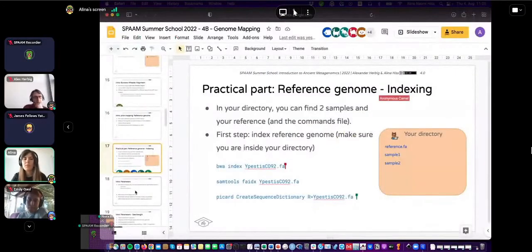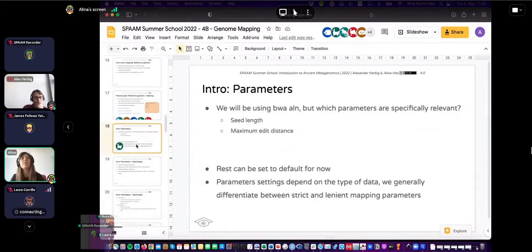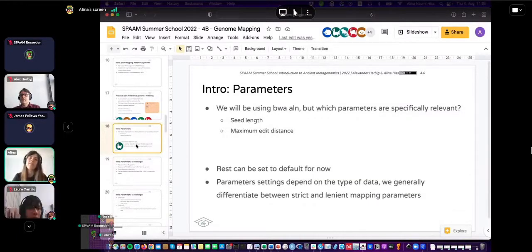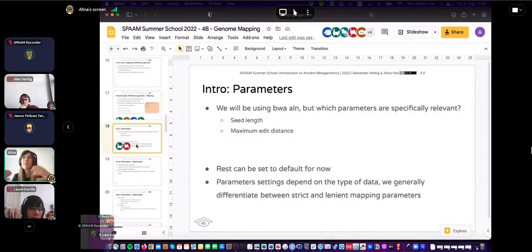Once indexing is done, let's briefly discuss two important mapping parameters: seed length and maximum edit distance. Everything else in the command we'll leave at default parameters. These two parameters depend on the type of data, and we differentiate between lenient and strict mapping parameters.